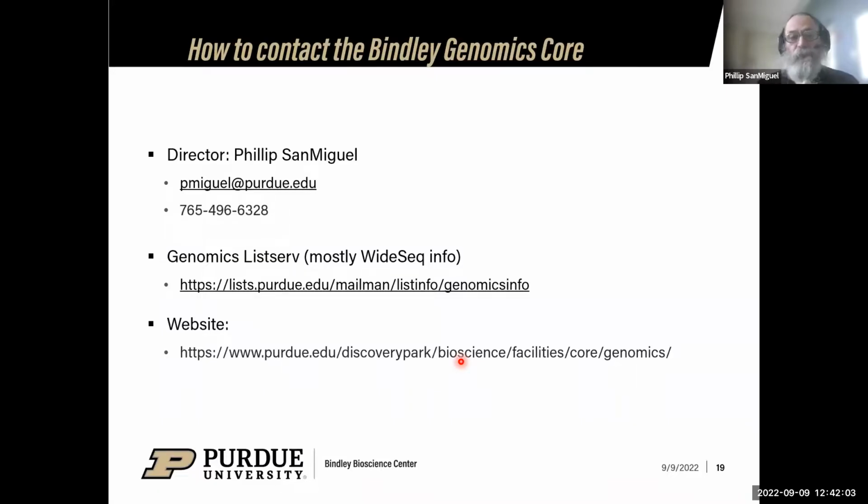In general, that would be the way it would work ideally, and often I think it would work that way. If instead you have two bands because you're actually amplifying two different regions of the genome that just happen to be members of a gene family that differ, say, with the presence or absence of an intron, then you might get overlapping sequence. It might be similar to each other, so it might be difficult to assemble that.